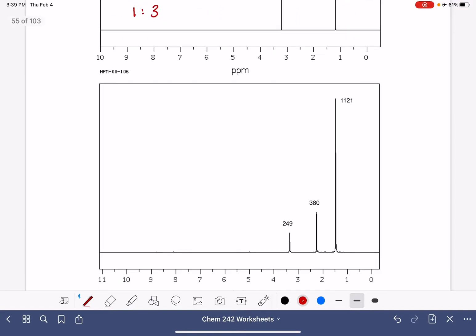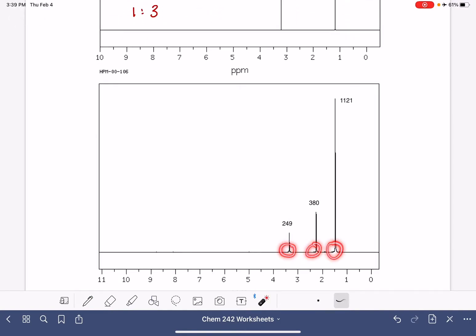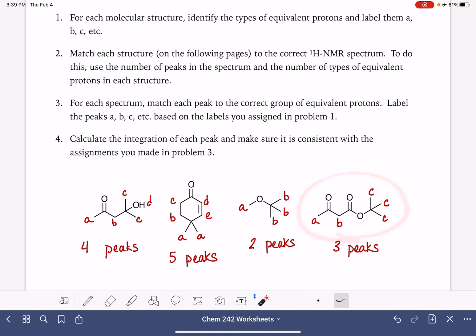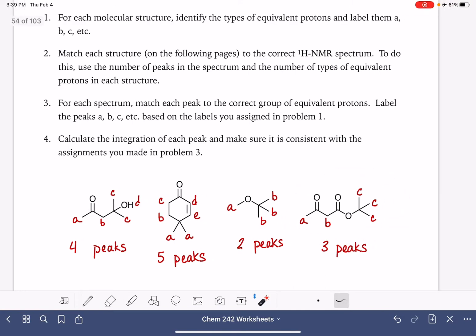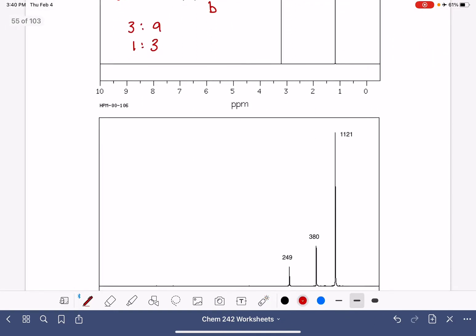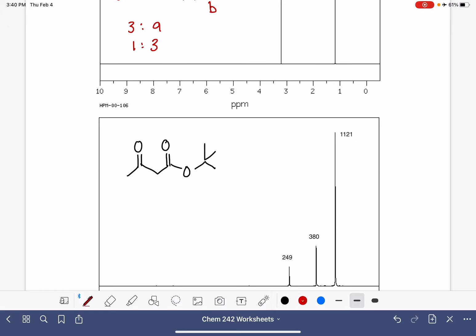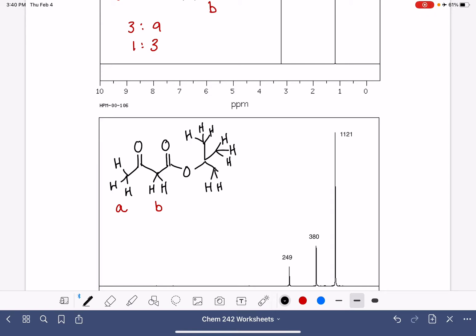Let's take a look at our next spectrum. This spectrum has three peaks, so we want the molecule with three different types of protons, which is this one. I'm going to copy its structure to analyze the NMR. Drawing the hydrogens in: the first hydrogens are labeled A, then we have two hydrogens labeled B, and then we have our nine hydrogens on the tert-butyl group labeled C.